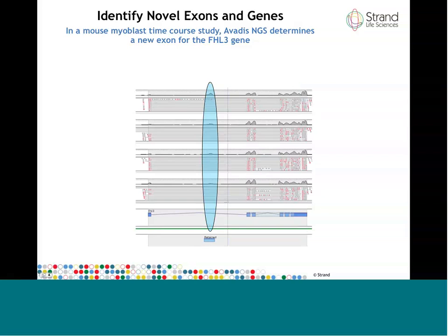If such a region was not present within the boundaries of a gene, then we would actually call a new gene instead of calling it a new exon within a known gene.